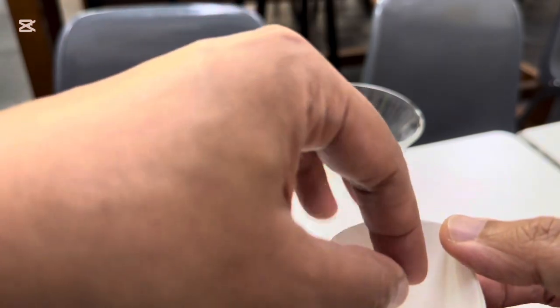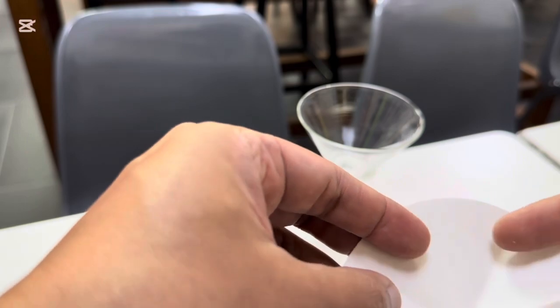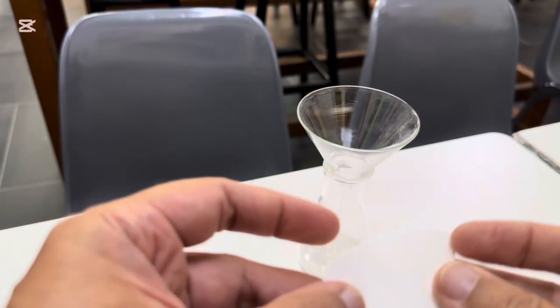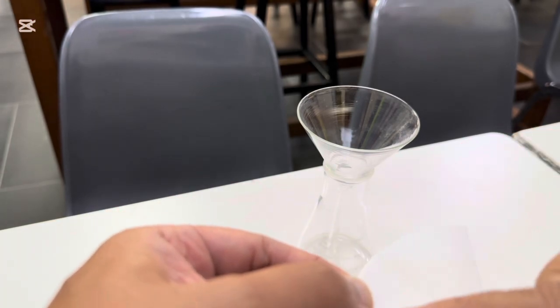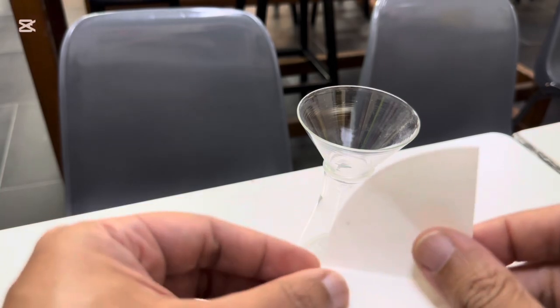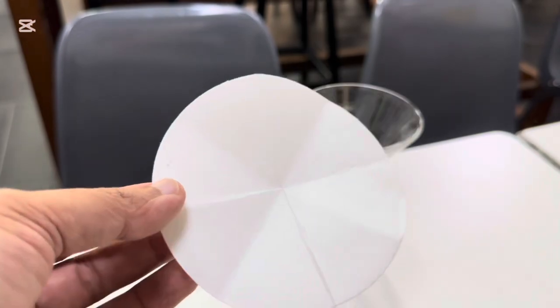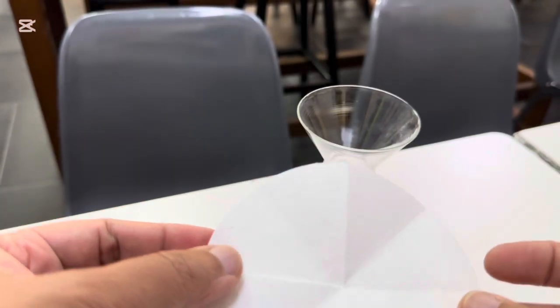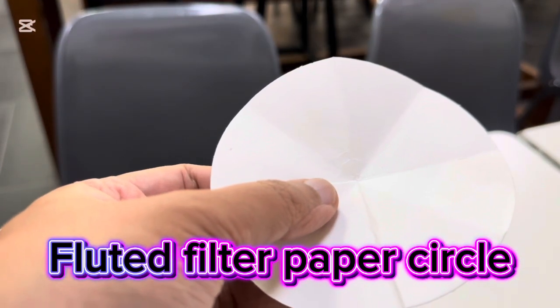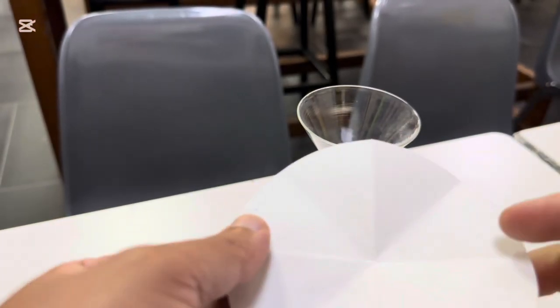You might think, well, that doesn't really reduce the time too much if we just had a single sheet. But when you think about it, this is just two sections here, and if I open it up, you then realize that the only point where filtration is actually happening is where you only have a quarter of your full disc. So it looks very, very inefficient. So I'm going to show you how to form a fluted filter paper, which allows you to have very speedy filtrations all the way through.